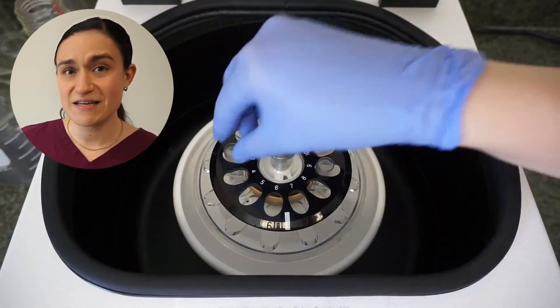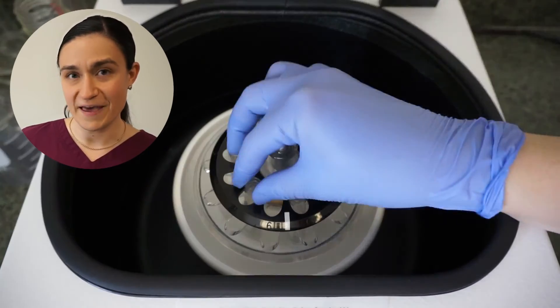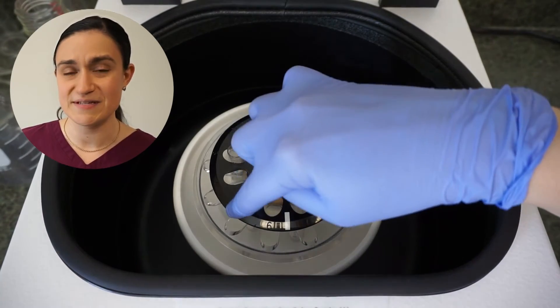Now, if you're going to load six tubes, we want to place them like so with an empty space in between each. That way, each tube will have another similarly weighted tube across from it and your rotor will stay balanced.